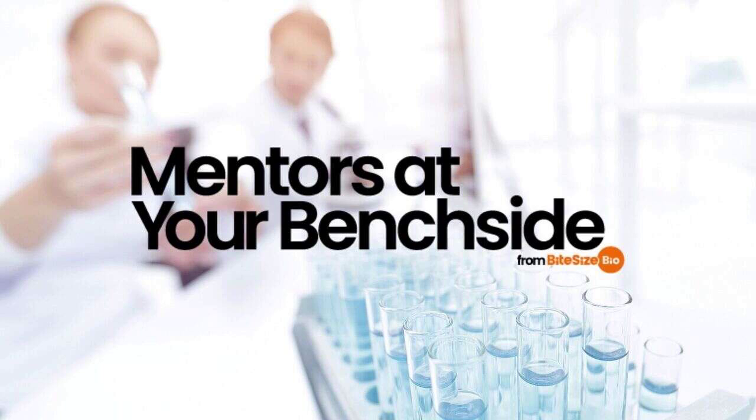Number 5, using old colonies. One more point that people forget when setting up their starter cultures or overnight cultures is the age of the plate you are using to pick your colony. If your plate is old, you may have picked a nice big colony, but it will not all be living cells. And if there were satellite colonies sitting around the original colony where the antibiotic no longer exists, those will not have plasmid and will be introduced into your culture. So, streak a fresh plate before starting to ensure the best result.